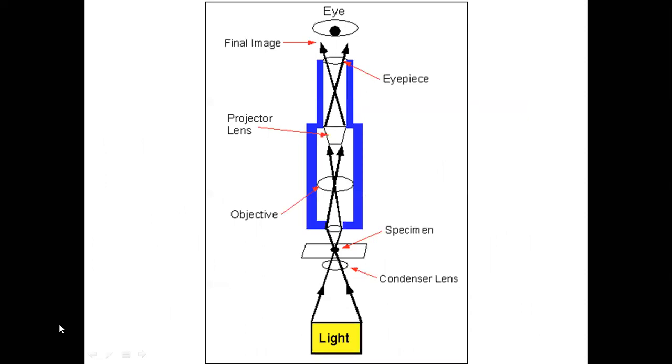So this is about the optics, the light traveling. This is how the light is traveling inside the microscope. Okay, so this is the place. So this was about your illuminator or the halogen lamp or the light source. Okay, so from this light source, the light will travel through the condenser. It is coming out of the aperture on the specimen. The light will pass through the specimen and it will reach your objective lens.